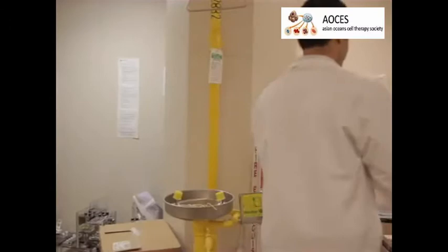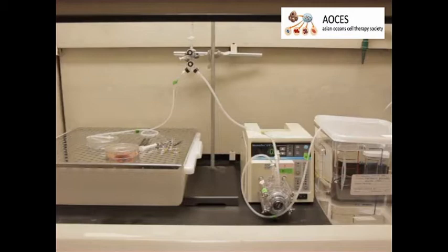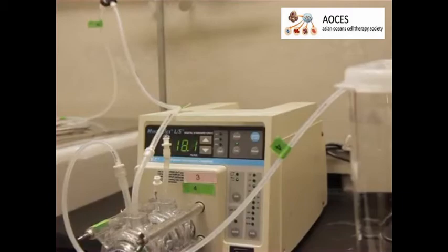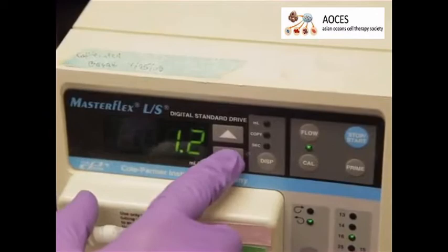To perform perfusion decellularization, begin by harvesting a rat liver by portal vein cannulation using an 18-gauge catheter. Leave the inferior and superior vena cava open. Keep the organ hydrated in phosphate buffered saline, or PBS, in a 10-centimeter petri dish. Next, set up a perfusion system that consists of an 8-liter reservoir, peristaltic pump, and a bubble trap. Fill the perfusion system with PBS and keep it running for 10 minutes. Then fill a 10-centimeter petri dish with PBS and reduce the flow rate of the buffer to 1.2 milliliters per minute.